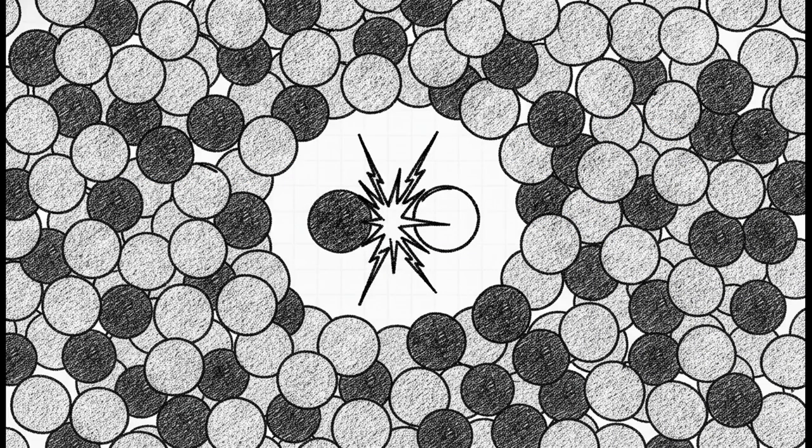But there's a catch. Because the ion trap holds absolutely everything at once in such a highly confined space, you can get a quirky phenomenon known as self-chemical ionization, or self-CI. Basically, overcrowding in the trap leads to random physical collisions between uncharged neutral molecules and those fast oscillating ions. These impacts can actually transfer protons around between the molecules, effectively changing their mass right before our eyes.